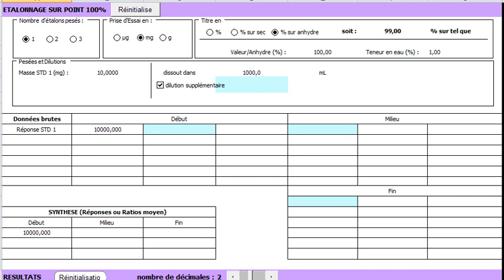Here we enter the areas or absorbances of the standards. The form accepts up to 3 repetitions of each standard. You may decide, for example, to inject them at the beginning, the middle, and the end of the sequence, and up to 3 repetitions per each: 1, 2, and 3.